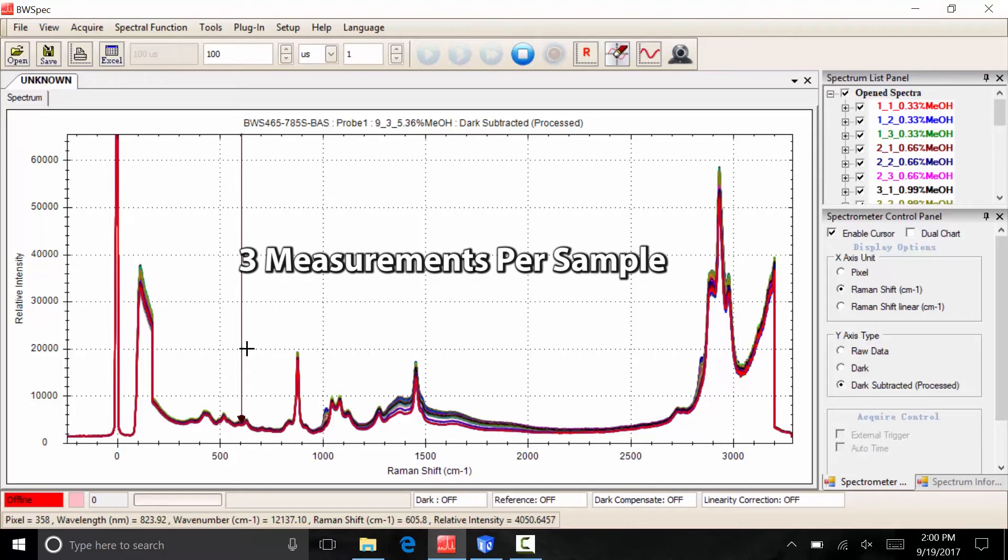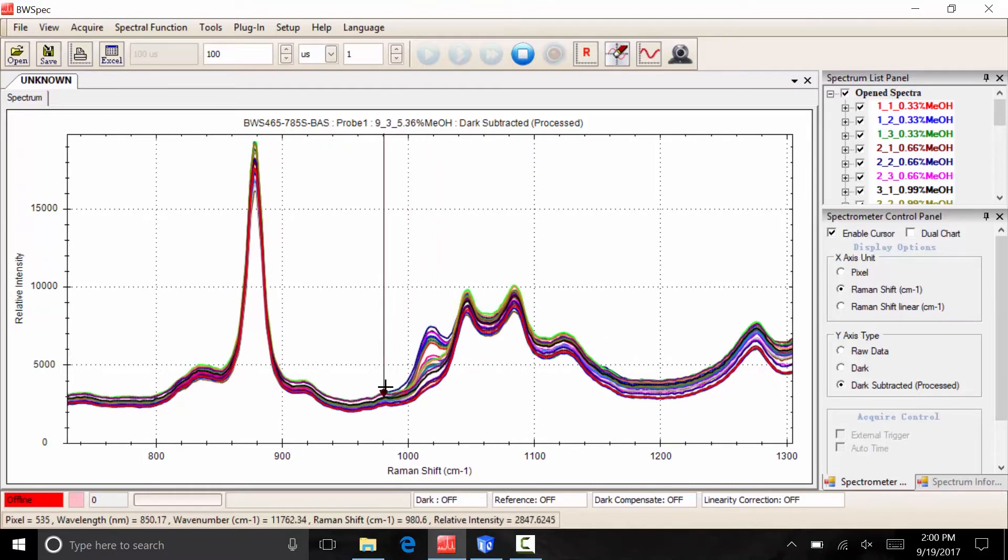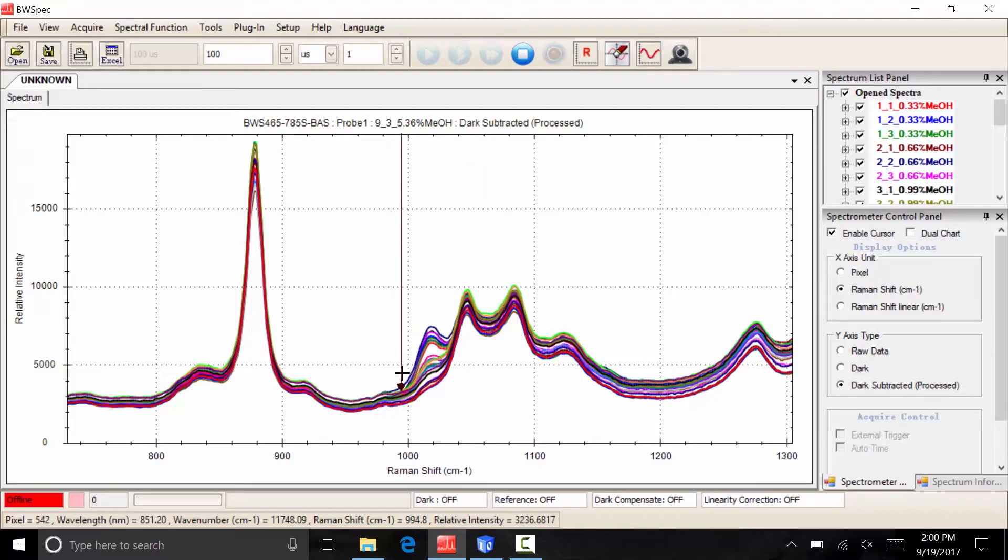Upon inspection of the data collected, we can observe a positive correlation between the Raman intensity from the samples and the concentration of methanol in the samples, particularly from the peak at around 1040 wavenumbers, which corresponds to methanol.